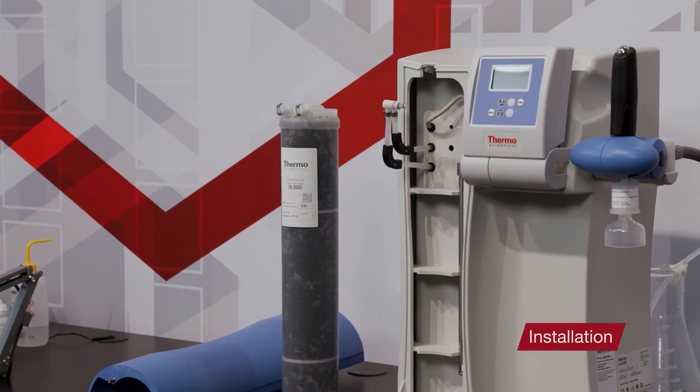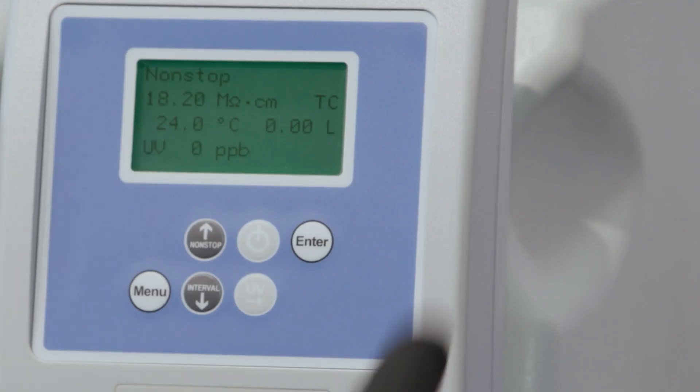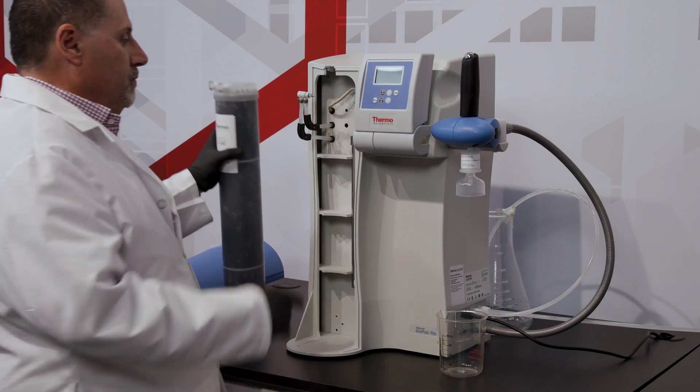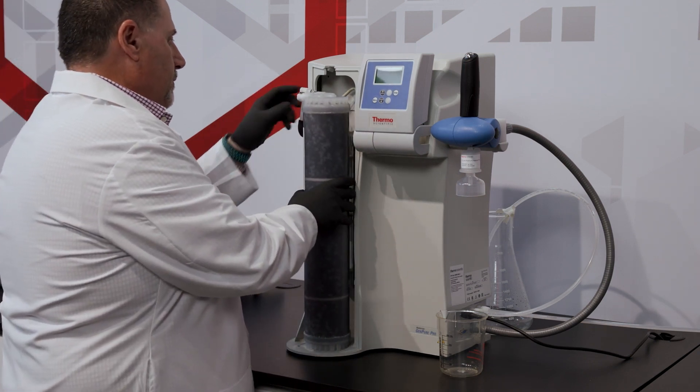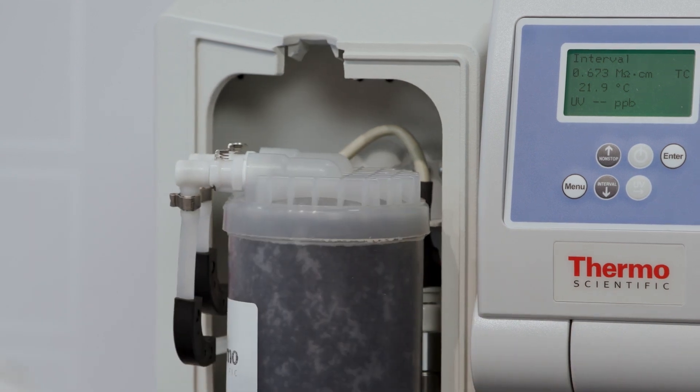To begin the installation, turn off the system's water supply, then turn off the system itself by pressing the blue on/off button. Place the new UltraPure cartridge into your system, inserting the quick connect couplings into the cartridge until they audibly click into place.